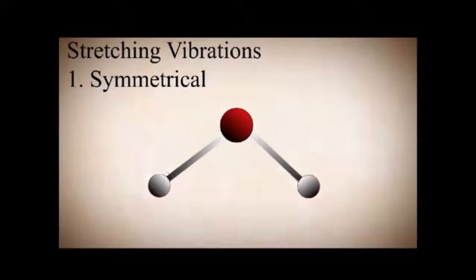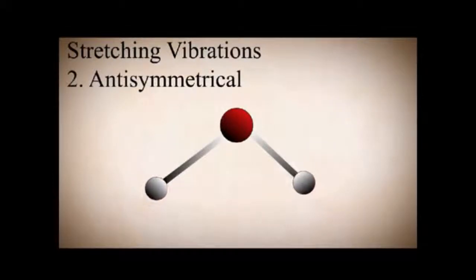In symmetrical vibration, you can see here in animation that both the atoms are going away from the central atom and simultaneously they are going towards the central atom. It means that there is change in the bond length.